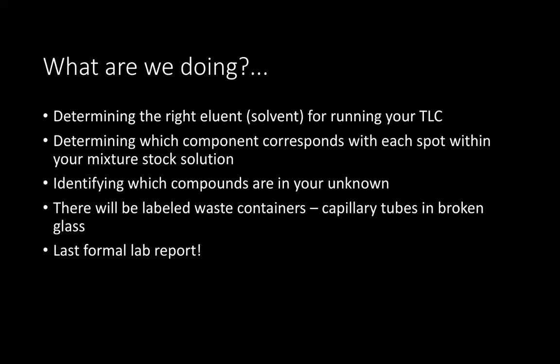In this lab, we'll be separating a mixture of organic compounds using thin layer chromatography. For this lab, some of the things that we'll be doing will be determining the correct eluent or solvent for running your TLC plate. You'll be determining which component corresponds with each spot within your mixture stock solution, i.e. identifying your compounds. You'll also be given an unknown and have to identify the compounds within your unknown based on your understanding of your original TLC plates.